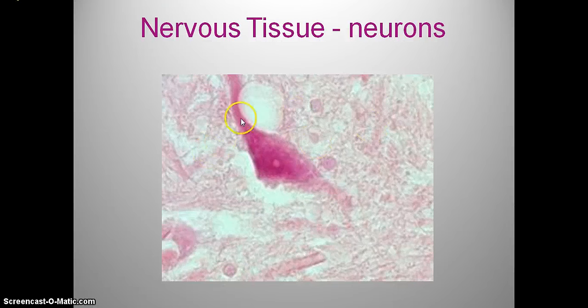Nerves right here. This is a nerve cell. This is its shape. We have a nucleus right in the center. This cell is coming from cerebrum and cerebellum. And those cells, we know that nerves need to conduct electric impulses. So the cells have extensions, tiny, tiny fibers. They're not fibers, obviously, they're parts of the cells, which conduct impulses, and they sometimes can be very long. We call them dendrites and axons.